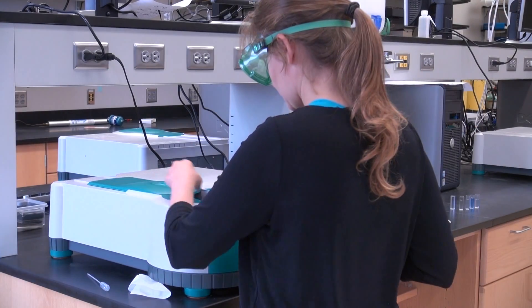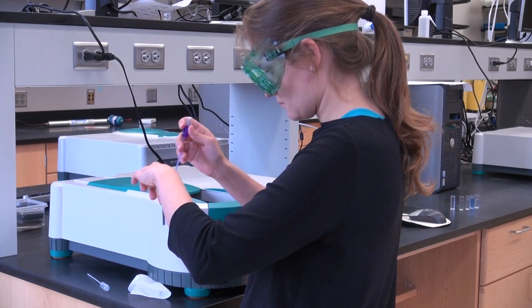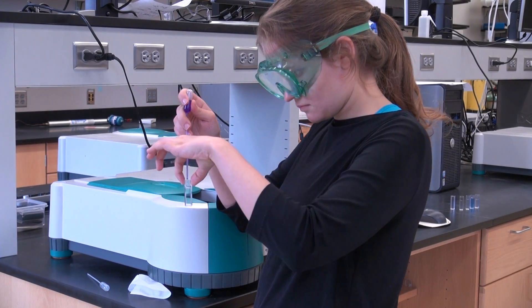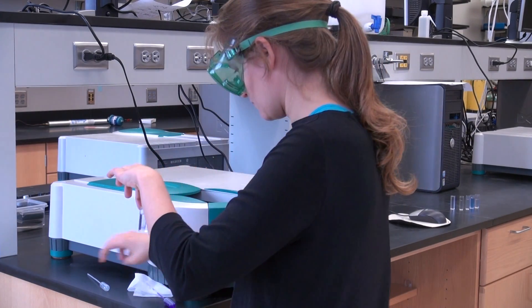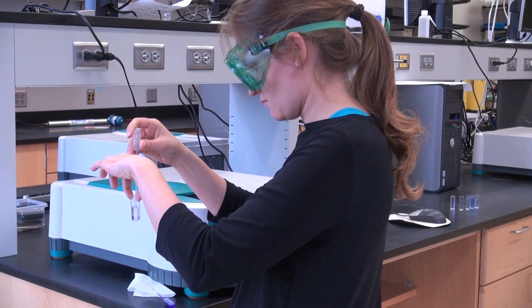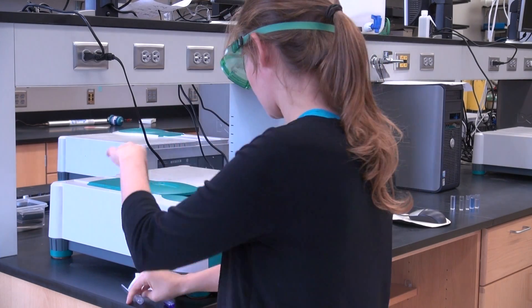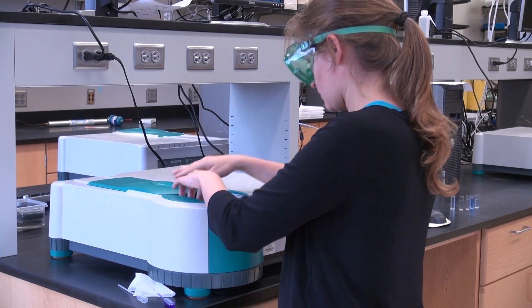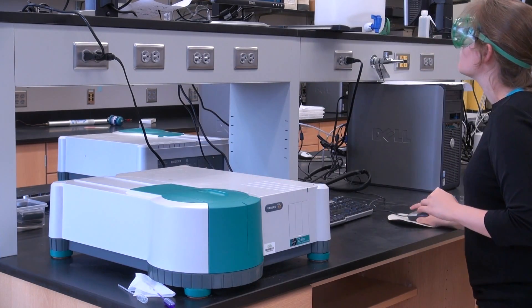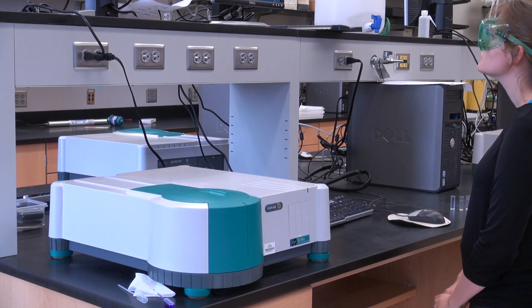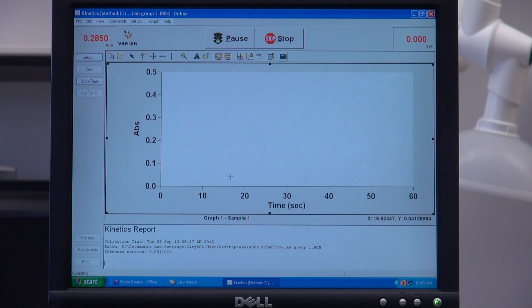Quickly take the cuvette out of the spectrophotometer, add one drop of crystal violet to the sodium hydroxide in the cuvette, use your other pipette to suck up the contents of the cuvette, then squeeze everything back into the cuvette. This mixes the solutions. Put the cuvette back in the spectrophotometer. Close the cover and immediately hit OK on the computer to start collecting data.